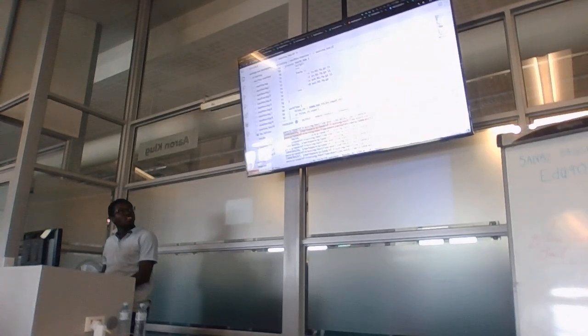Can you see this? Yeah, this is a sample ID. And then the second element is an array which gives us as a first element the forward read, this one, and the second element there, the reverse read, right?